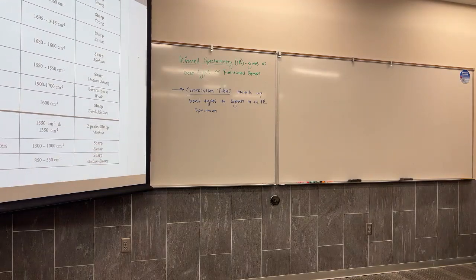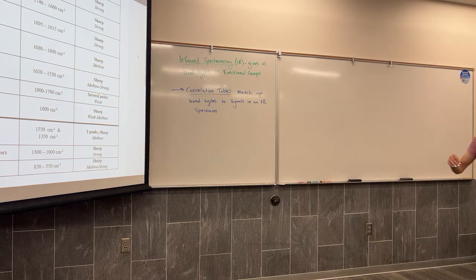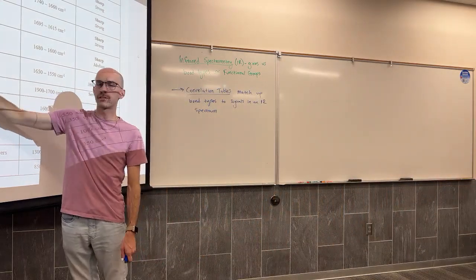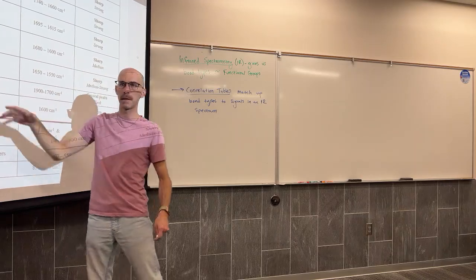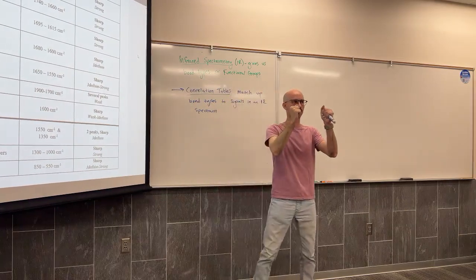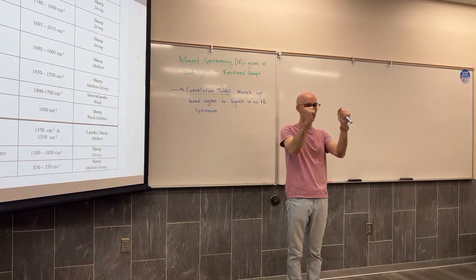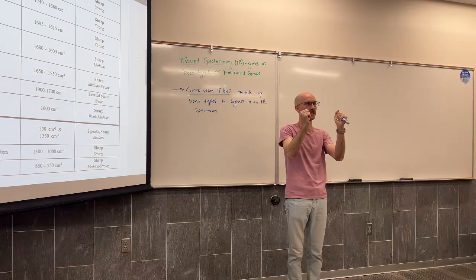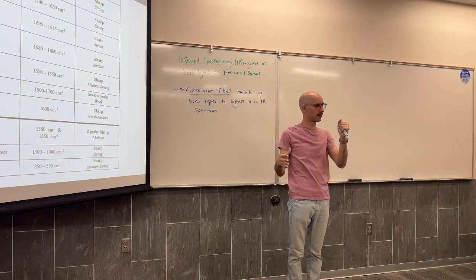But if you scroll down, and you look down here, 3 rows above this dark black line, you see NH again, but this time it's described as bending, meaning that the bond is no longer stretching back and forth, but the bond is actually compressing on itself side to side relative to the other things that the nitrogen is bonding to.